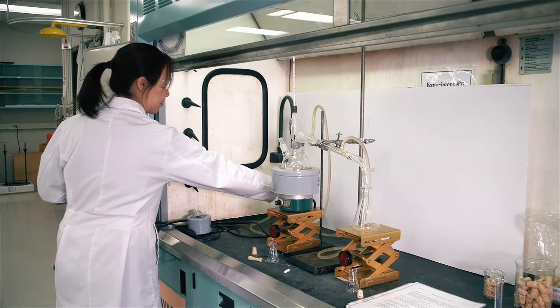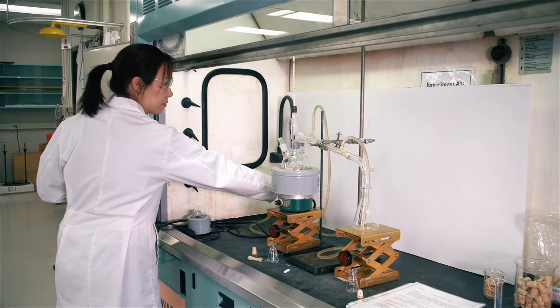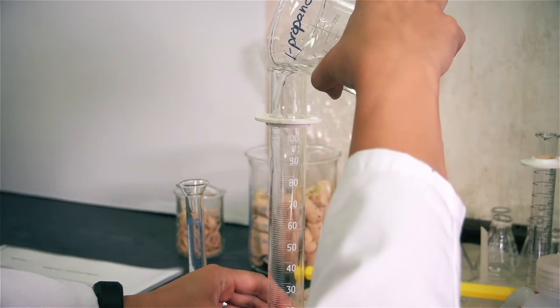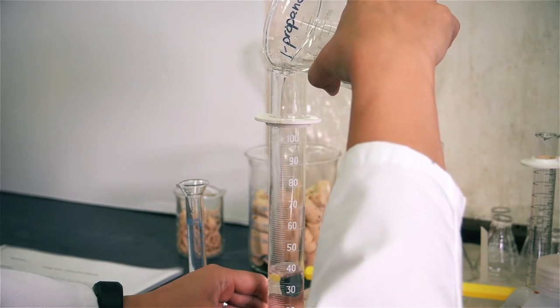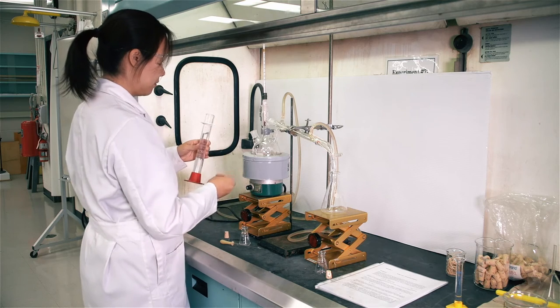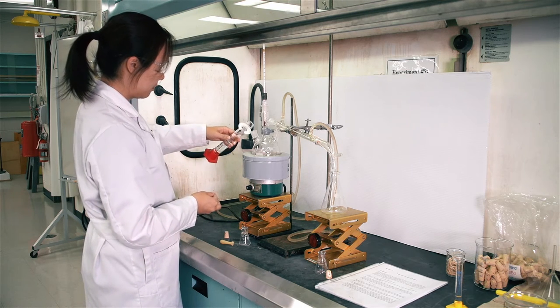The first step is to set up the apparatus as shown. Turn on the condenser water. Place approximately 95 ml of propan-1-ol and a stirring bar into the three-neck boiling flask. Make sure all the joints in the glassware are closed.